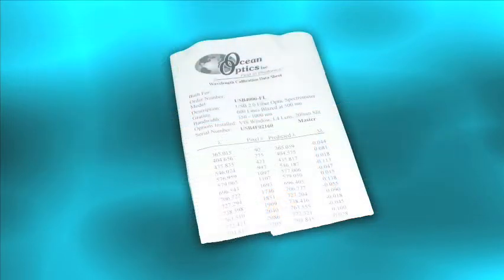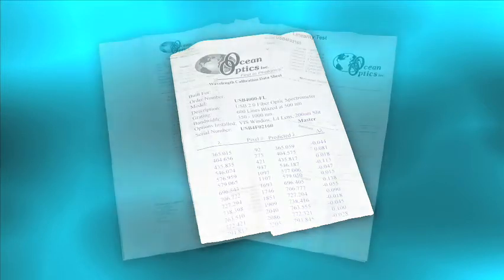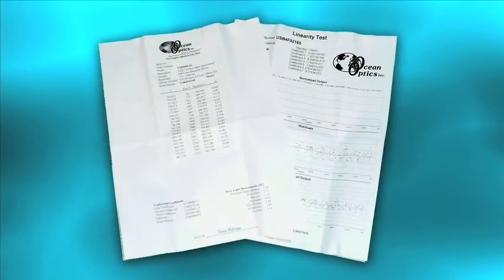The Technical Resources CD has operating instructions for all Ocean Optics products. Our USB Spectrometers come preloaded with the wavelength calibration coefficients in an EEPROM, but we still provide hardcopy wavelength calibration sheets. Be sure to save this in a safe place, just in case you need it later.